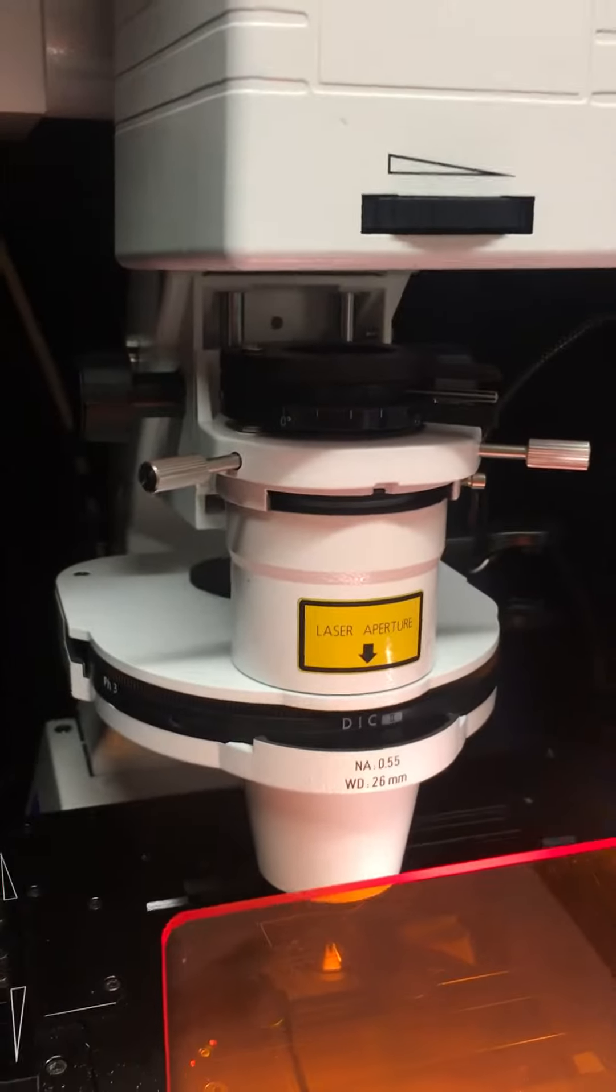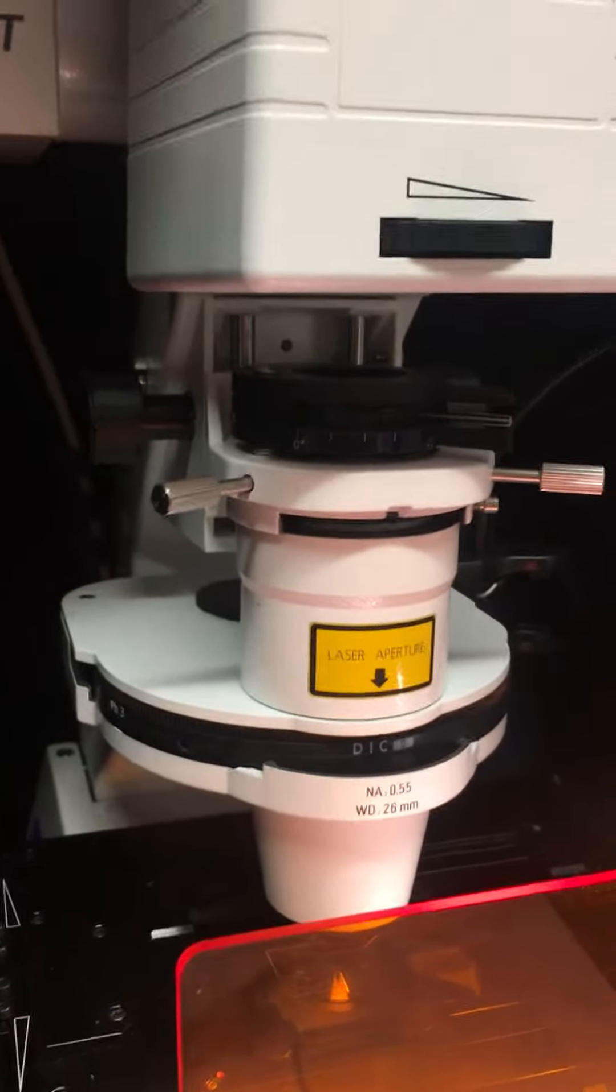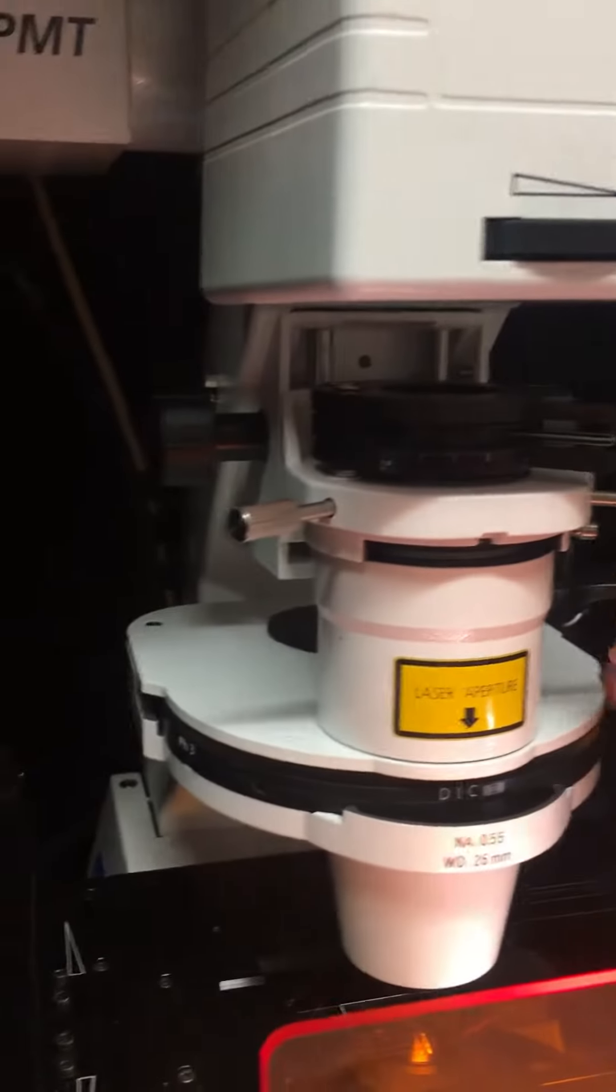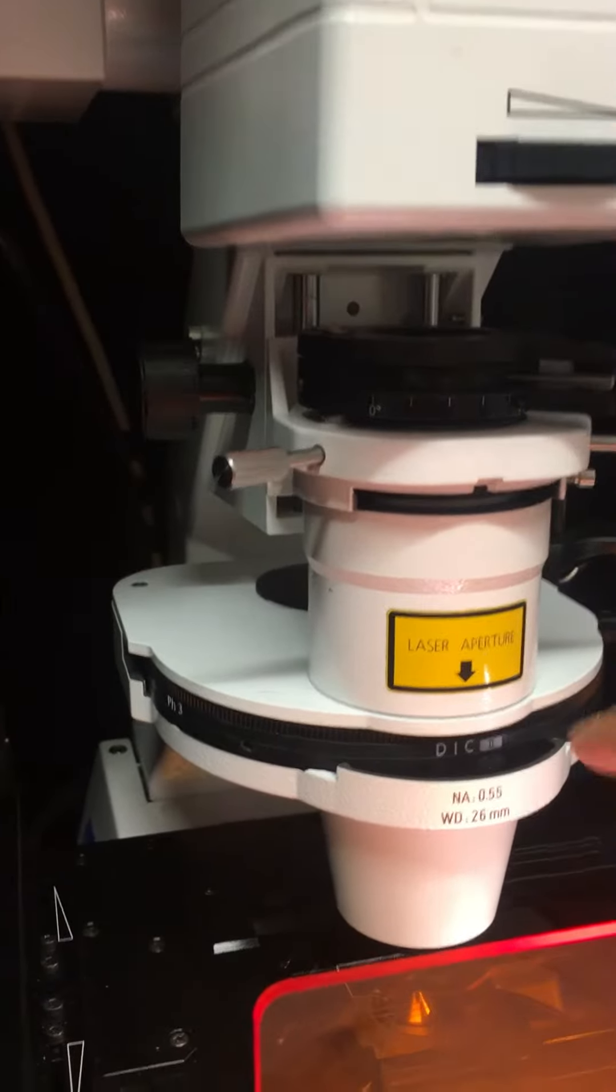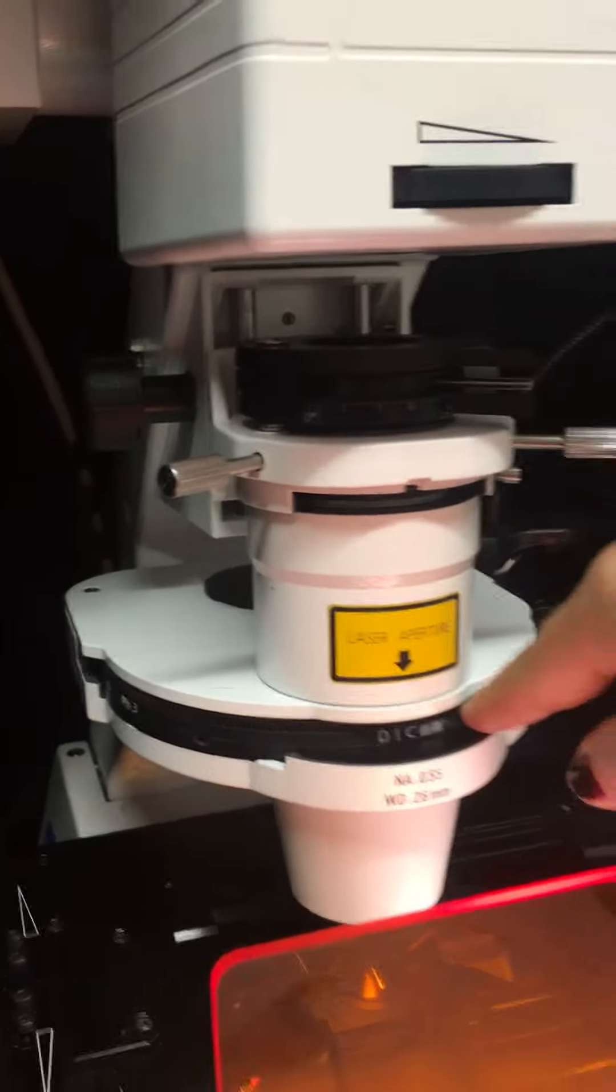Then you're going to need two NOMARSKI prisms. One is placed above the condenser here, and another is placed underneath the objective here.